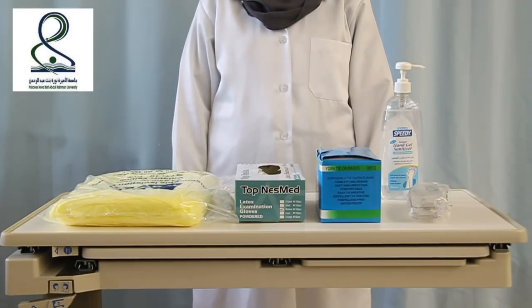First of all we are going to don the PPE. We start with hand hygiene.